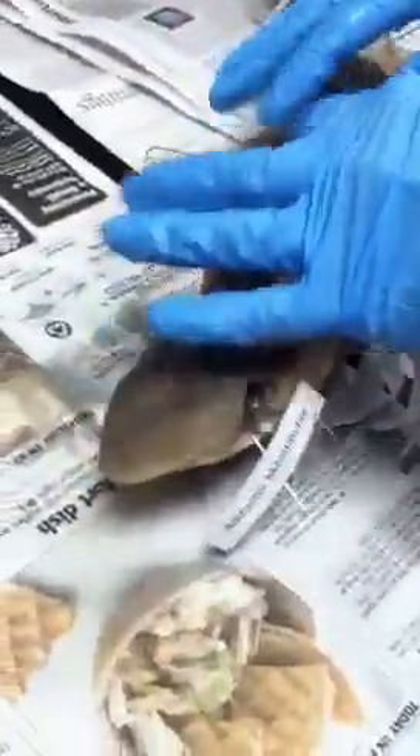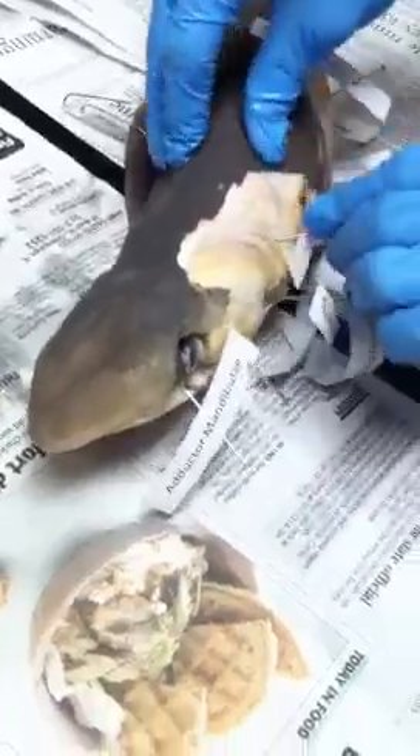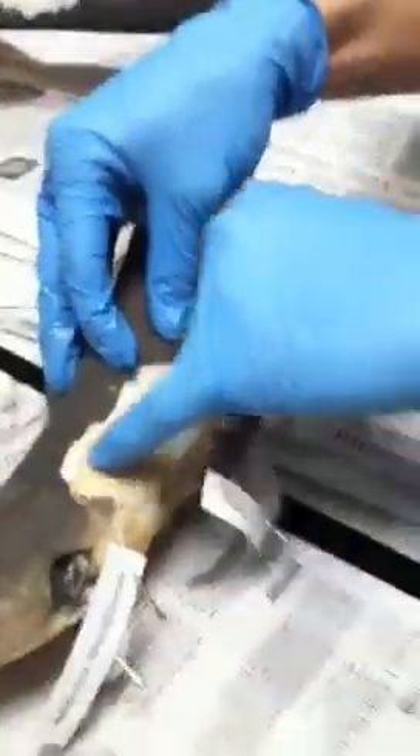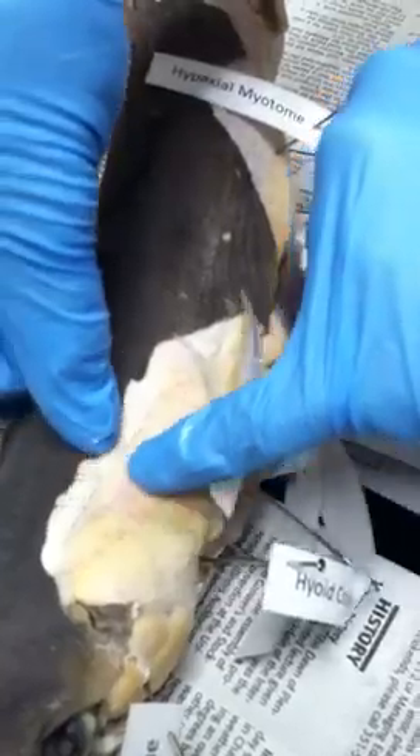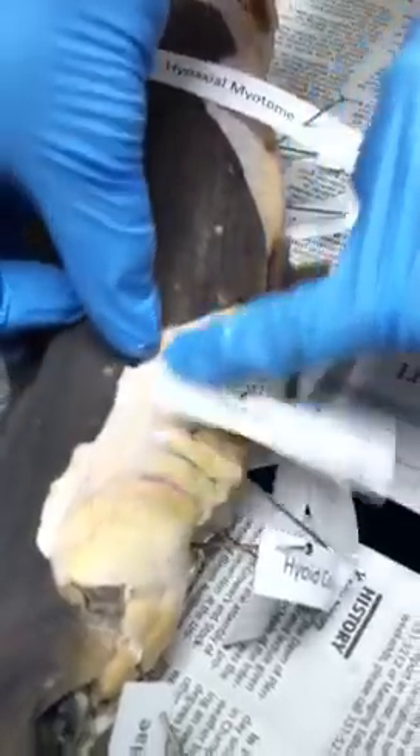Now I go to the dorsal region — I have three muscles up here. The first one is right above the dorsal constrictor, and that right here is the cucularis. With my fingers in between here, it kind of makes a little triangle — it's the cucularis. I go ahead and pin it right there.